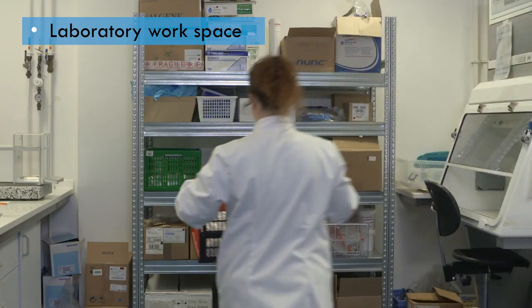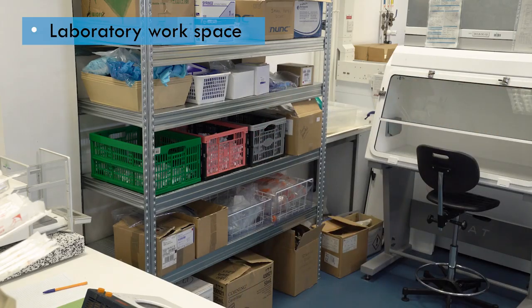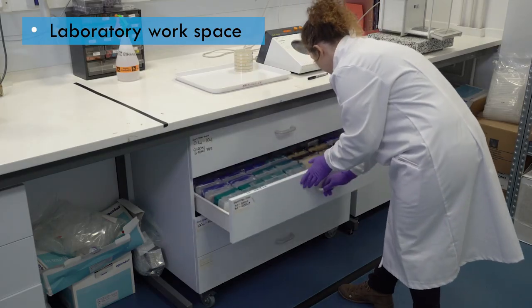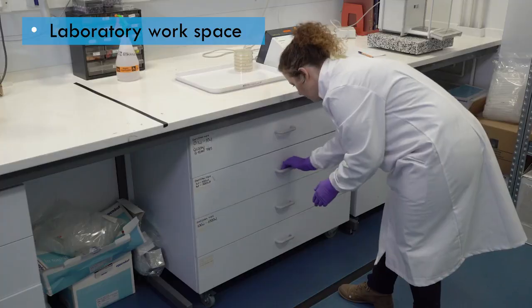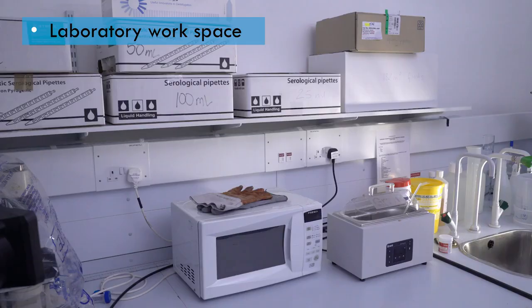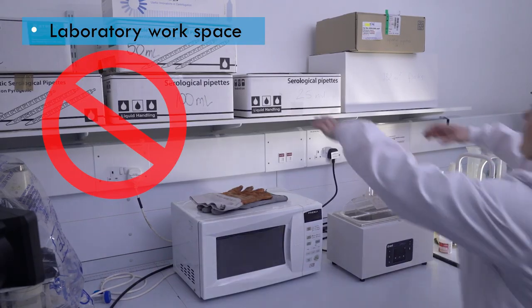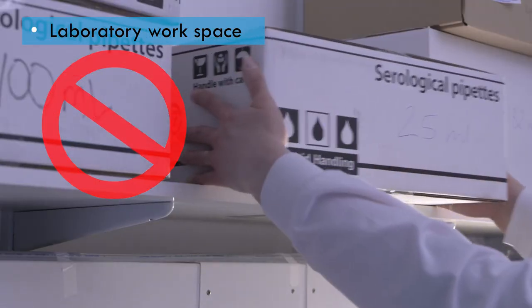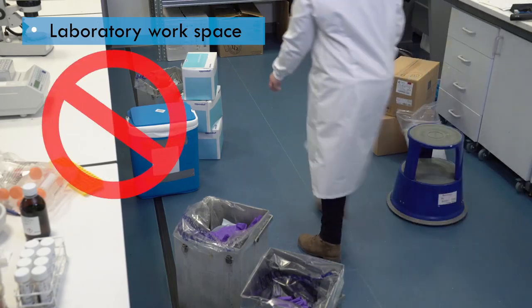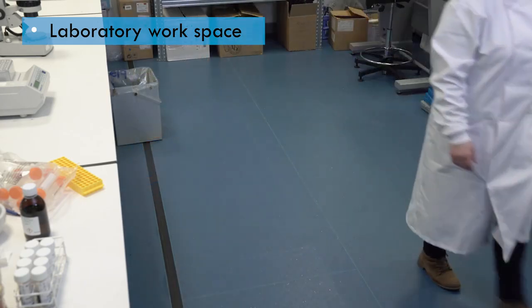Ideally, there should be enough storage space, on shelving and in cupboards and drawers, to keep the working areas clear. Organize the laboratory space so that any regularly used items, such as spare boxes of pipette tips, are stored in drawers or cupboards near to the work area. Avoid storing items on shelving above the microbiology work area, as any dust that settles there can be dislodged and contaminate the work surface. Floors should not be used as storage areas and should be kept clear of everything, except waste bins if they're needed.